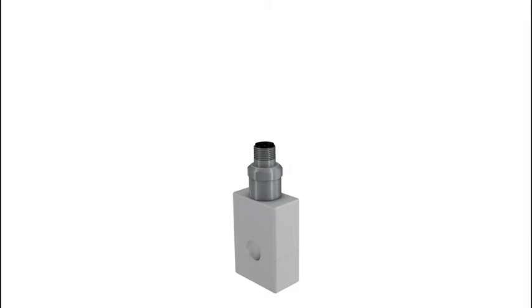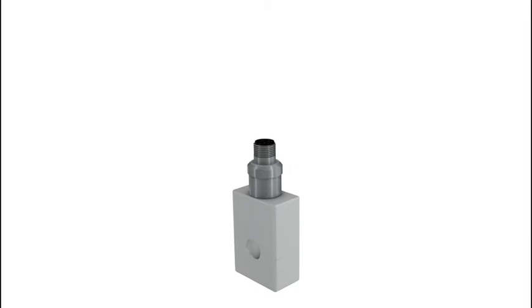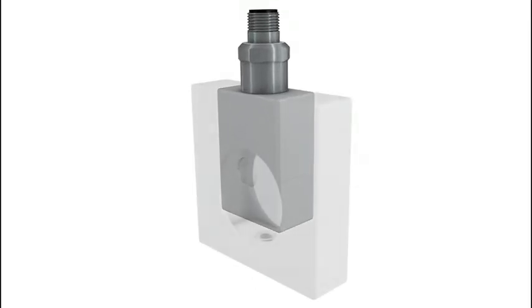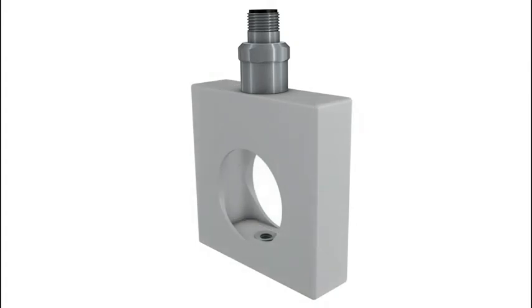Can be combined with diverse pipe sizes. There are clamp blocks for larger pipes and tightening straps for pipe external diameters up to 57 millimeters. All these process connections are simple and easy to install.